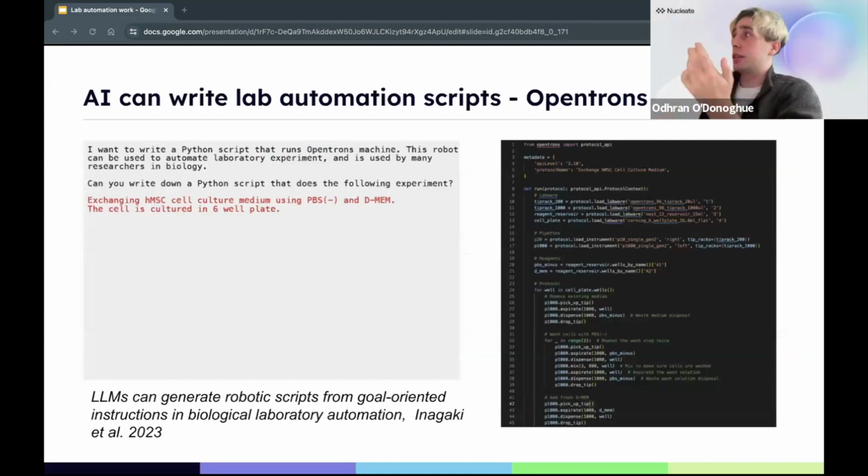Similarly, right now, models are being used to write scripts. Opentrons has an open project getting LLMs to write their lab automation scripts. There's a few academics that are working on this as well. We've seen Gabe Gomez at CMU having ideas around this. The Emerald Cloud Lab teams themselves are also working on this. You also see this being done in chemistry, most notably perhaps with the Matter Lab in Toronto. But AI is getting pretty good at writing protocols and just writing the underlying code for lab automation. We're also doing quite active research in this area.